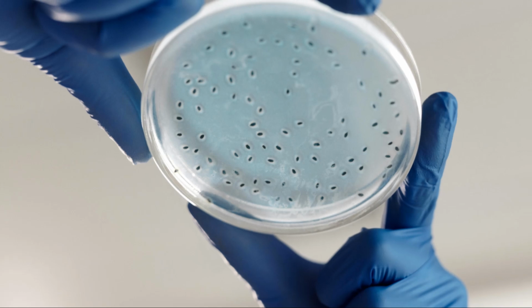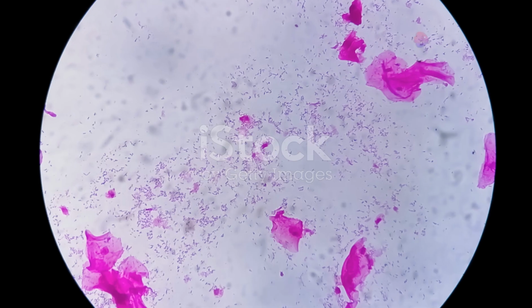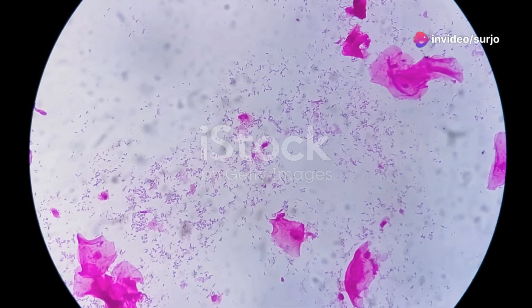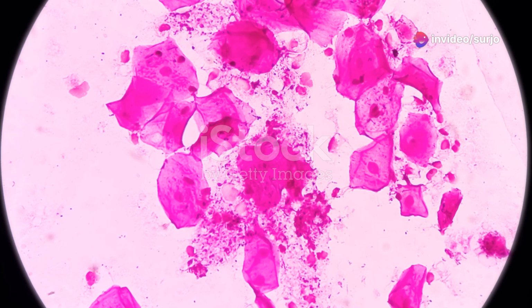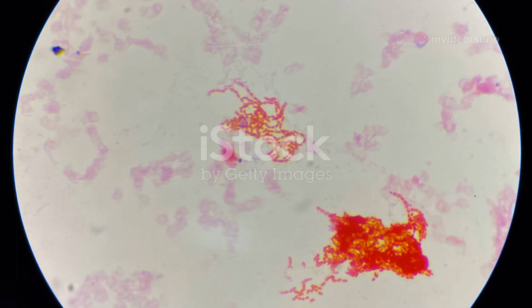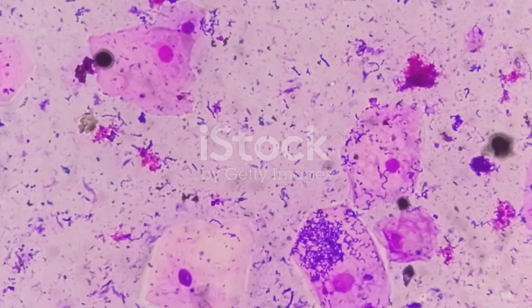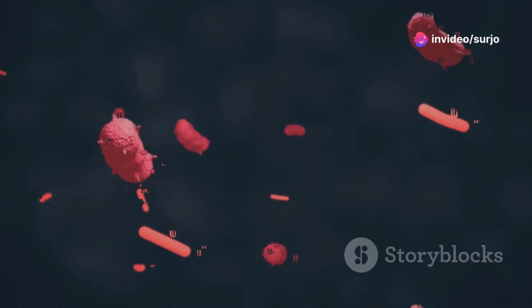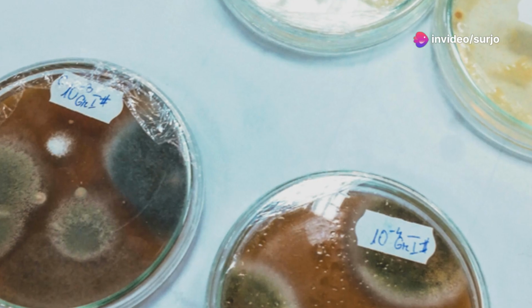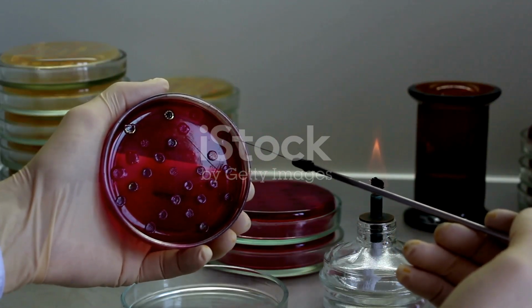Developed by Danish bacteriologist Hans Christian Gram in 1884, Gram staining is a differential staining technique that differentiates bacteria into two major groups, Gram-positive and Gram-negative. This distinction, based on the ability of bacterial cell walls to retain crystal violet dye during the staining process, reflects fundamental differences in cell wall structure, which have profound implications for bacterial identification, treatment, and pathogenesis.